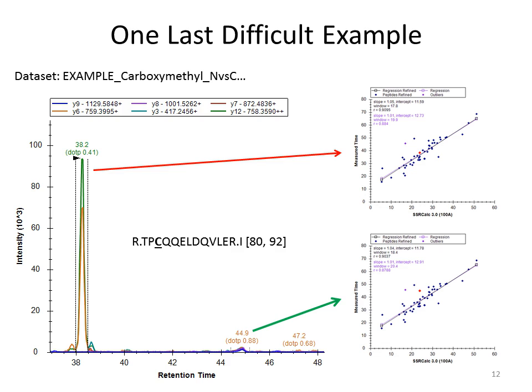And then a method was generated based loosely on that to make triple quad data and to target all of the transitions that are shown, plus others, and then plot it. And so this is showing how well the spectral library agrees with this data, and then plotting it to make sure that our retention time makes sense with where the peptide's eluting and picking it properly.